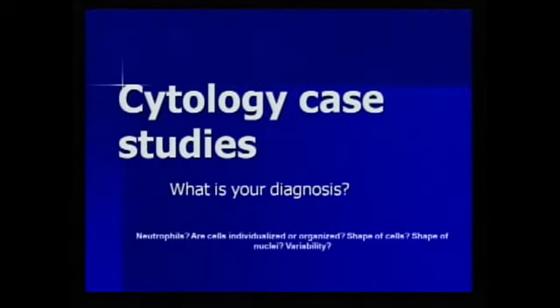I want to go over a number of aspirates with you, and some of them will be impression smears. So let's just call them our cytology case studies. And I want you to answer all the questions we've asked before. All of these will be, for the most part, adequately stained, adequately cellular. But let's remember how we approach these.